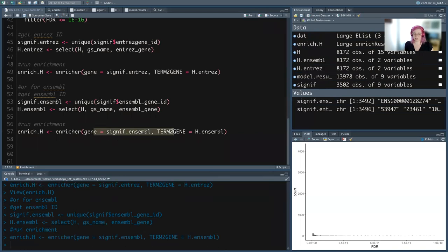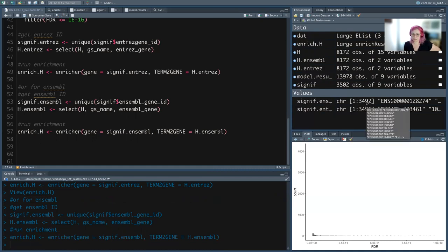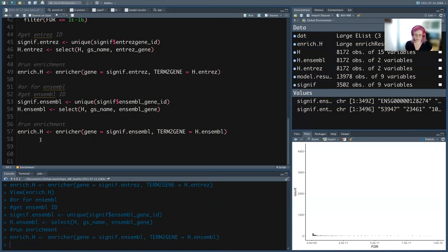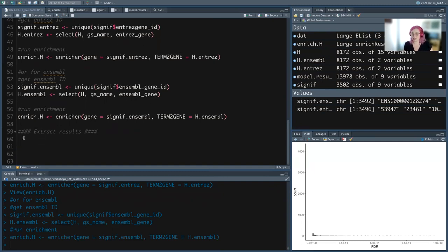You can also run it on the HGNC symbol gene names, but I know that has the most redundancy so I'm not running it here. Our results: what is this? It is an enrichResult — sometimes packages make their own data type. Really it's an S4 with a list of different data types.